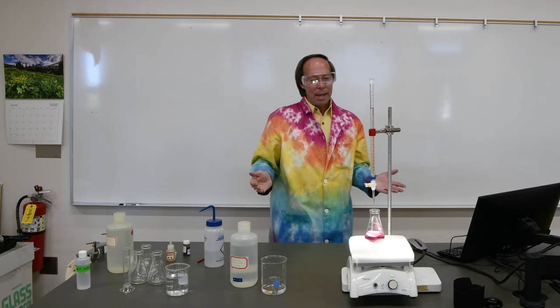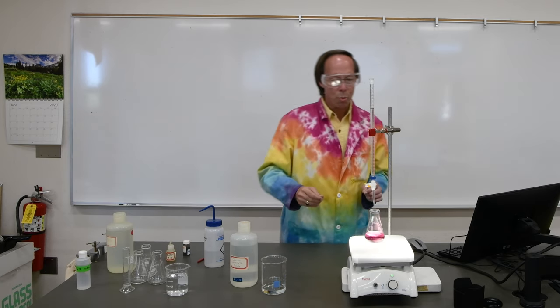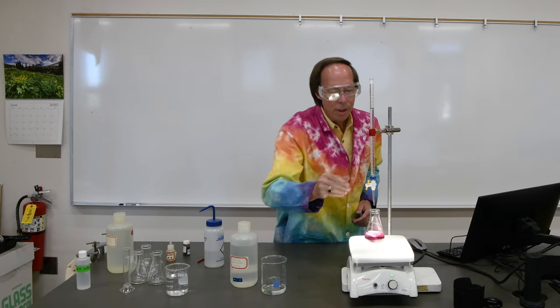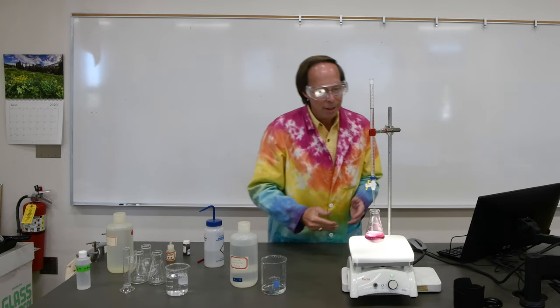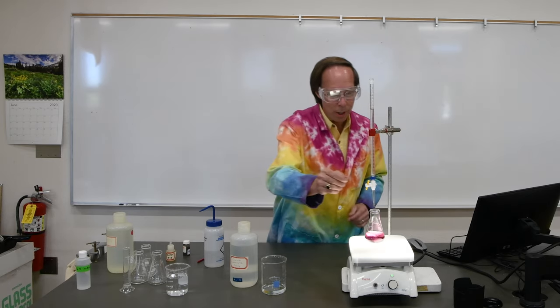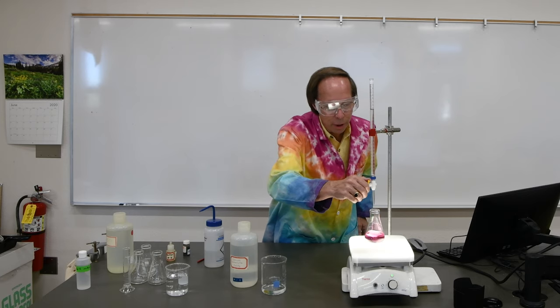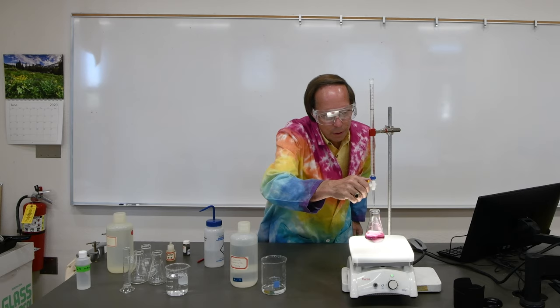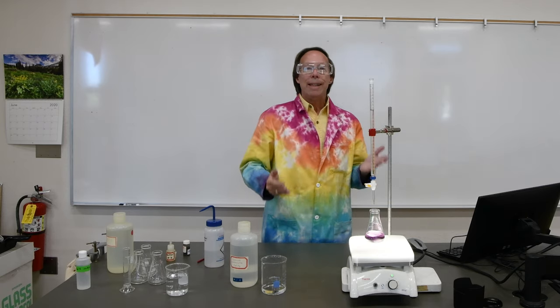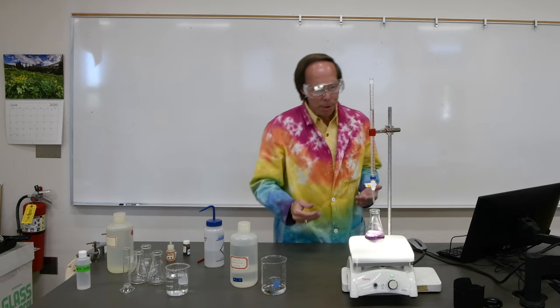All right, I've added about 5.5 milliliters, so I'm getting close to where I want it to be. So now I'm going to slow it down and just add it a single drop at a time. So we'll open the stopcock very carefully. There, now we have individual droplets falling in. We're going to watch. As soon as it begins to turn sort of a purple color, we know it's just about ready. So let's be standing by here. I think we're getting close. All right. Now you can see the color has sort of become purple. That usually means we're about one drop away from the end.